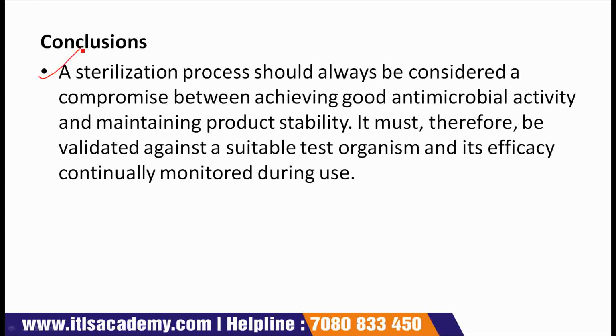So the conclusion is, a sterilization process should always be considered a compromise between achieving good antimicrobial activity and maintaining product stability. It must therefore be validated against a suitable test organism and its efficacy continually monitored during use.